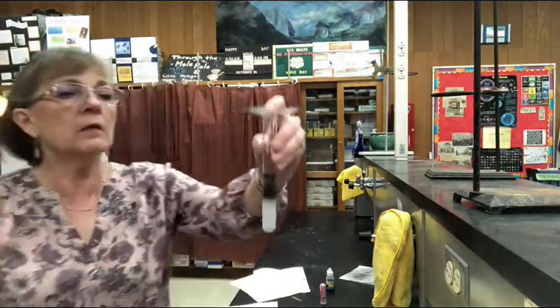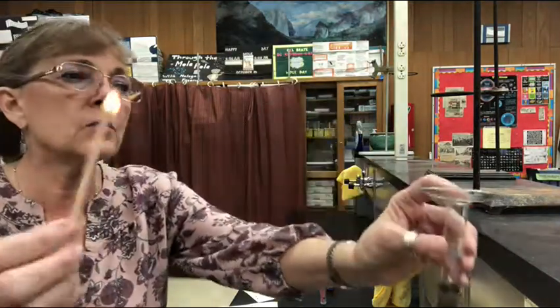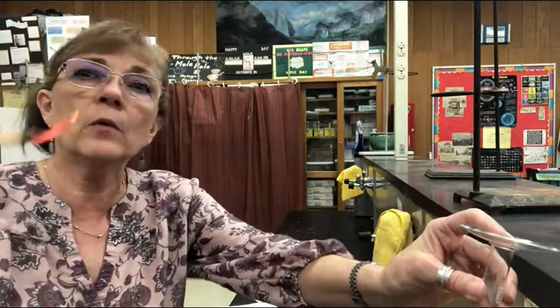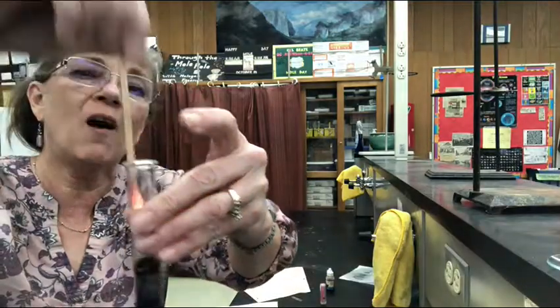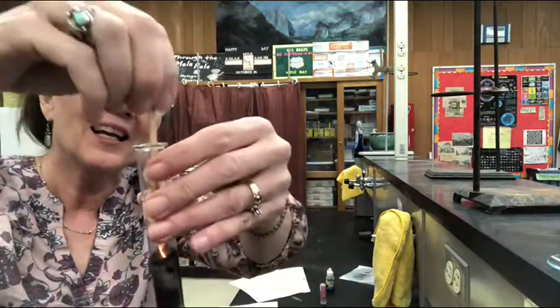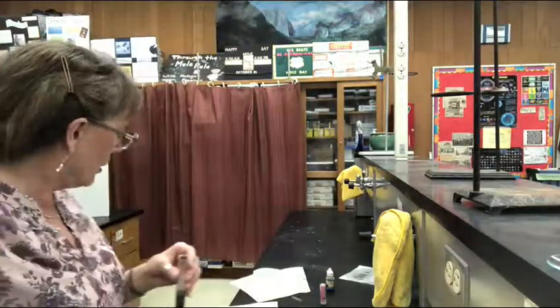Here's my manganese dioxide and hydrogen peroxide. I'm going to extinguish this so there's no flame, just glowing. Okay, and I'm going to put that in, and oh, I did it! Sometimes, yay! I'm glad you guys got to see this. Sometimes it relights. Very cool. That's reaction number 3.